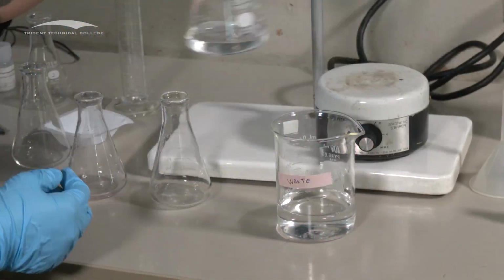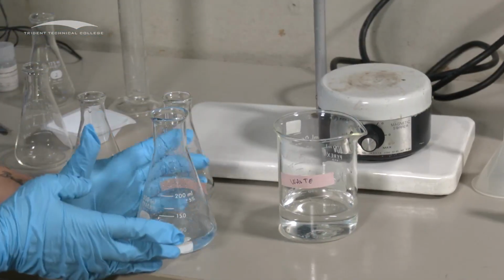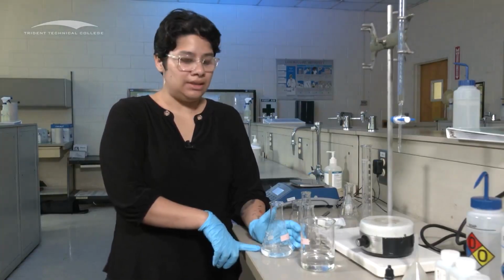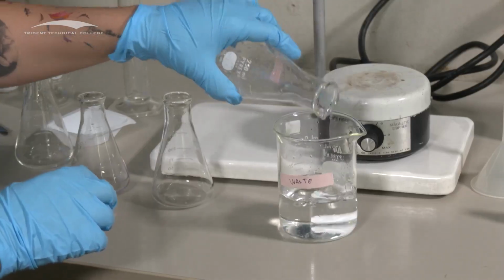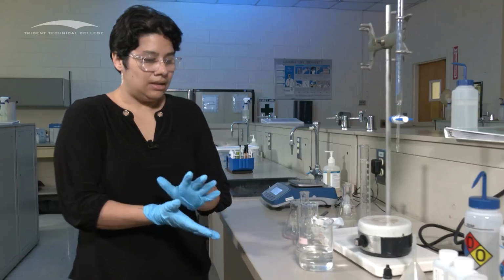And then please ask your instructor for a magnetic stir bar rescuer so they can teach you how to use it, and then they'll show you the first time, and then you can get it out. Please make sure that you don't throw that out in the sink. You can also put it in the waste as best as you can, and then separate it, and then use the rescuer to get it out, and then that is it.